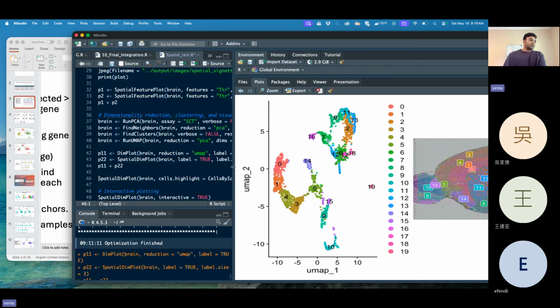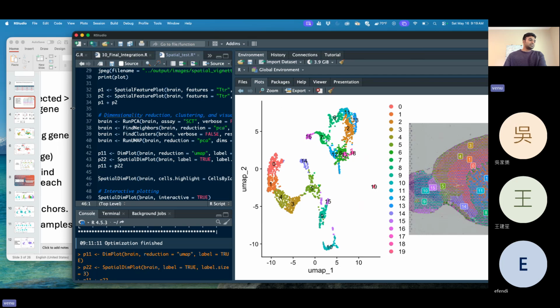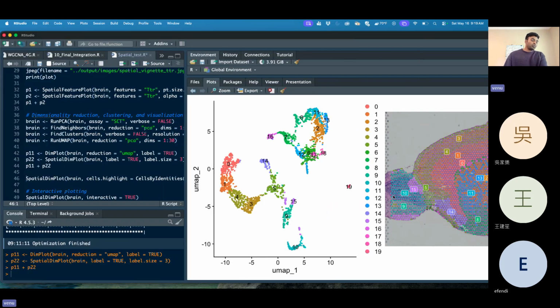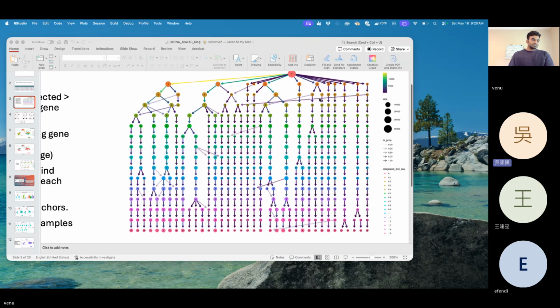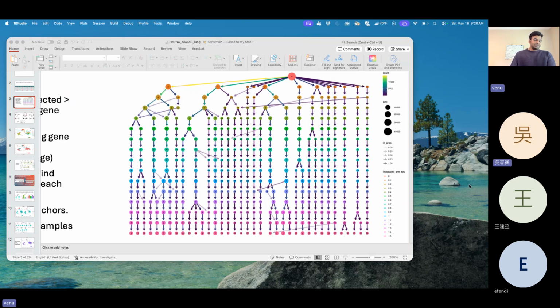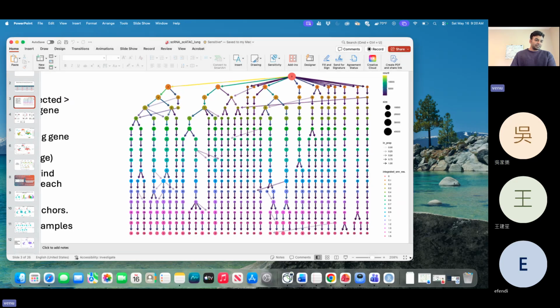Initially it considered these all are one. So now these all are cell spots, right? So this is like zero. Everything is zero. Initially, every spot is zero. So zero means a whole tissue region, yes, yes. The size is usually about millimeter by millimeter, yes.